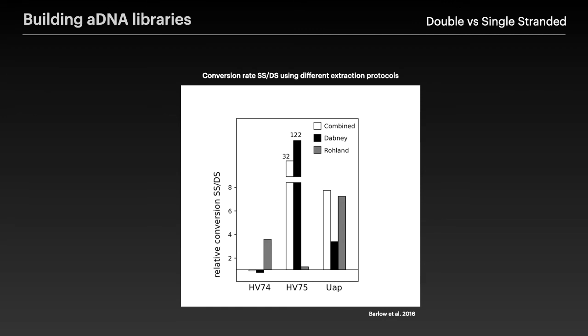That's probably because there are certain purification steps during the double-stranded library protocol, and you lose quite a lot of molecules during those purification steps. By having the molecules immobilized on the beads in the single-stranded library case, you can be sure that you will retain them in the next steps downstream in your method.